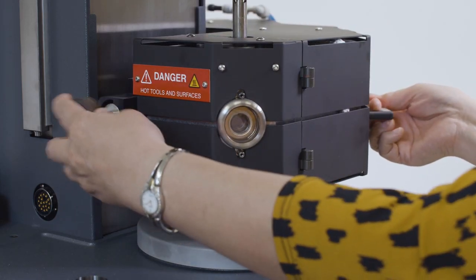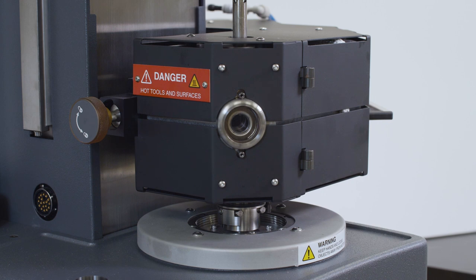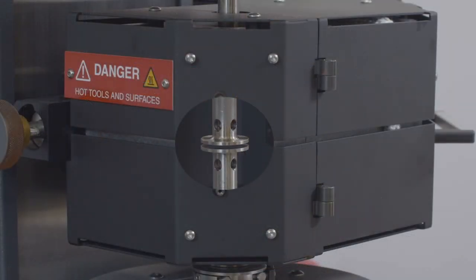Close the FCO oven. Preheat the geometry to the measurement temperature. Then zero the geometry gap.